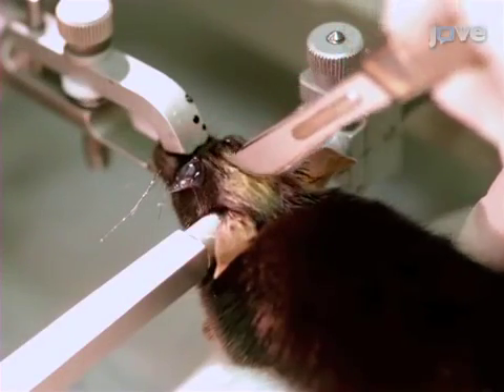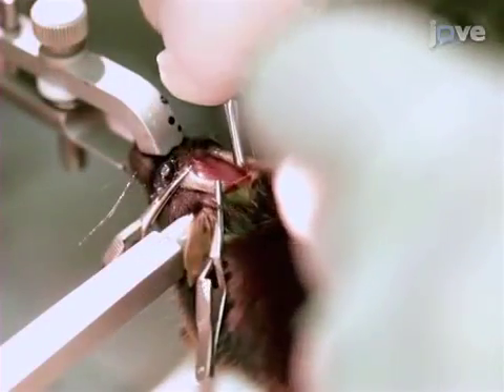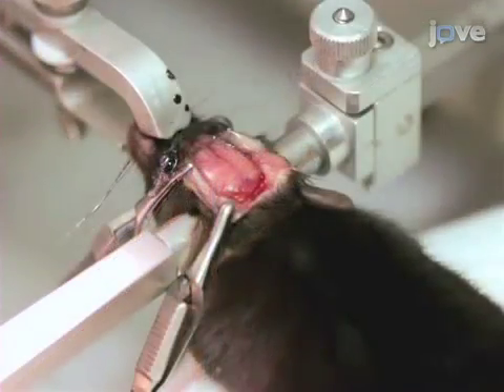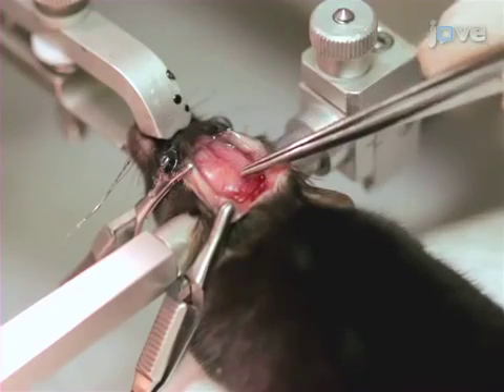Using a scalpel, cut open the scalp to just behind the ears. Place bulldog clips on the corners of the scalp to peel away the skin from the skull, making sure bregma and lambda are easily visible. Ensure that the suture from bregma to lambda is aligned, and reposition the head if necessary.